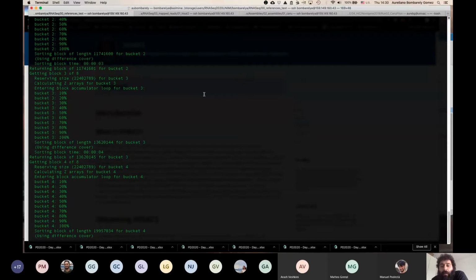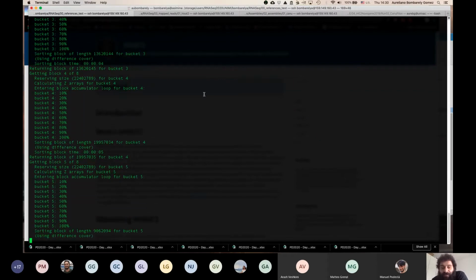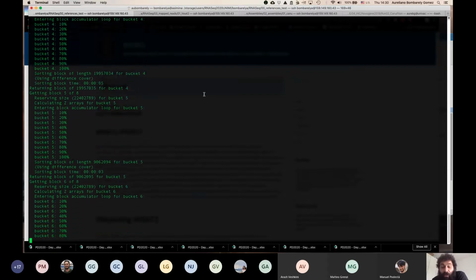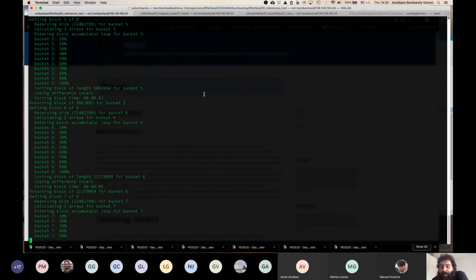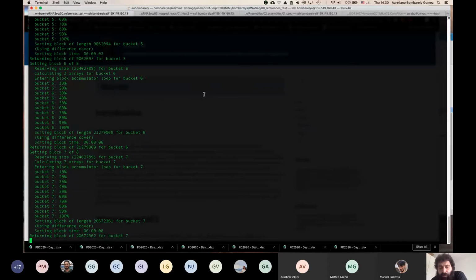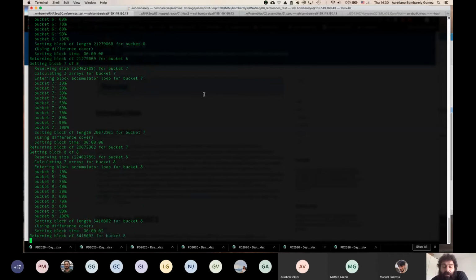Usually, another thing that I found that sometimes is also a source of errors is impatience. Sometimes you run a program and you think that the output is going to be automatic, but it takes some time for the program to run. So you need to wait. For example, if you are running a genome assembly, it can take between 5 and 10 days until you get the output. So depending on the kind of programs that you need to run, it's going to take time.